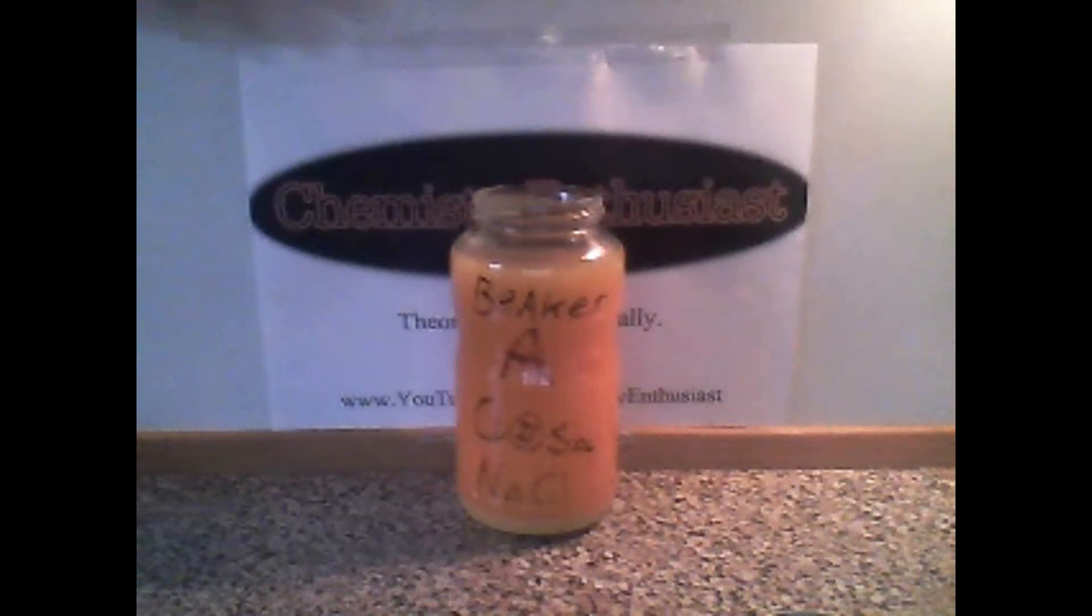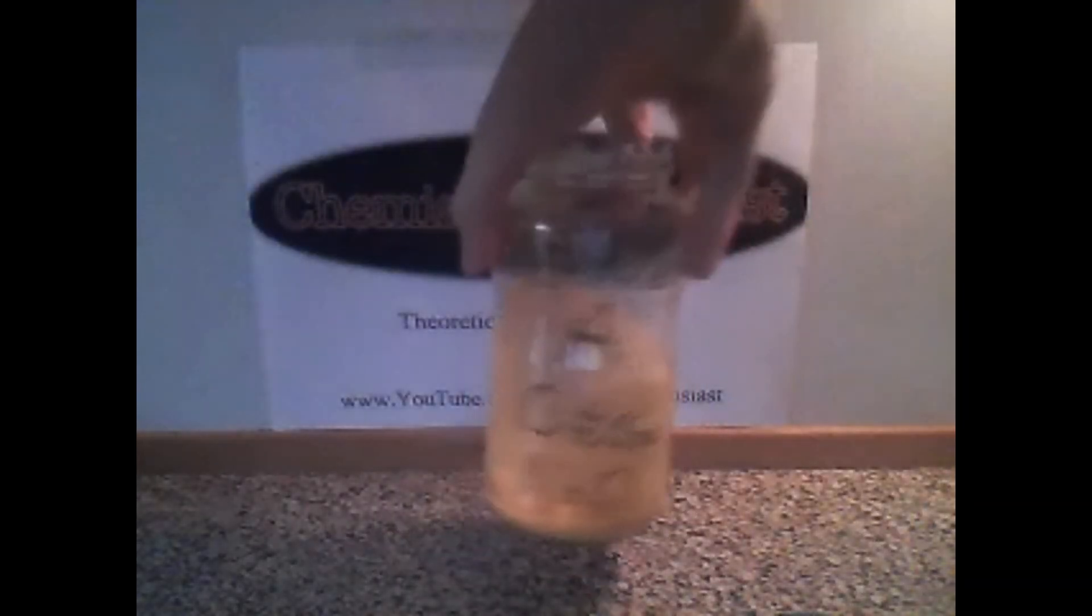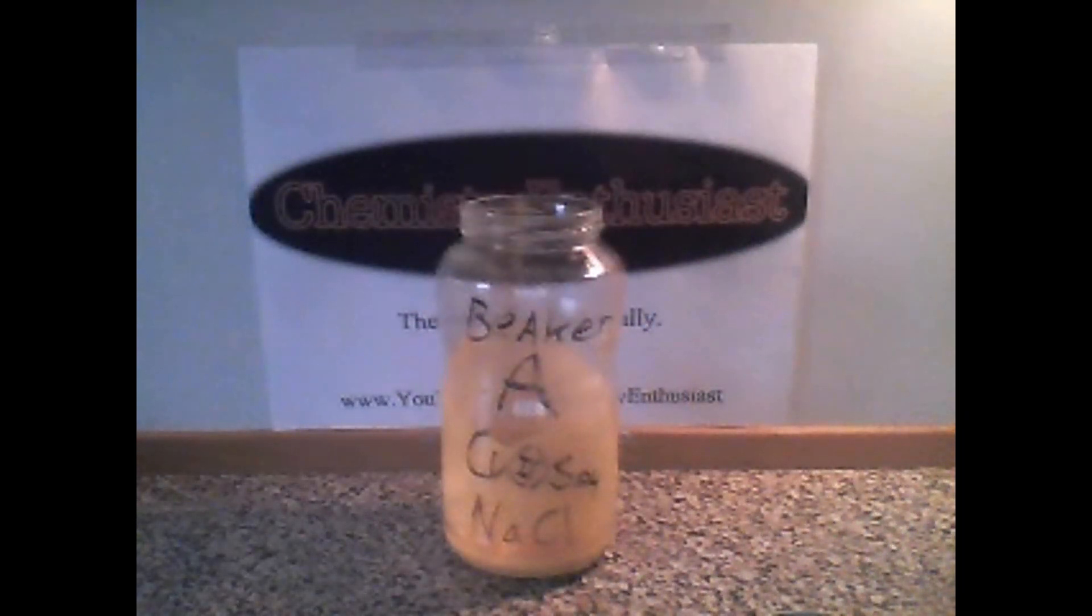Reacting with the water and the excess sodium hydroxide to form copper hydroxide. Now we are going to repeat the steps until you reach this color. Now lots of the impurities have been filtered away, and the copper chloride is at the bottom, and some of the copper chloride is turned into copper hydroxide.